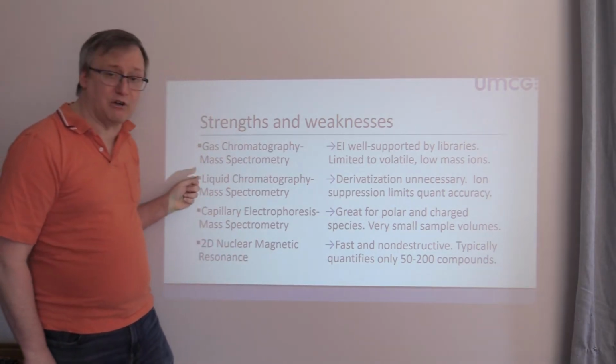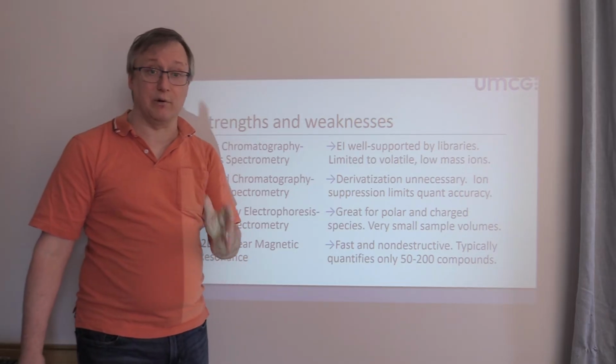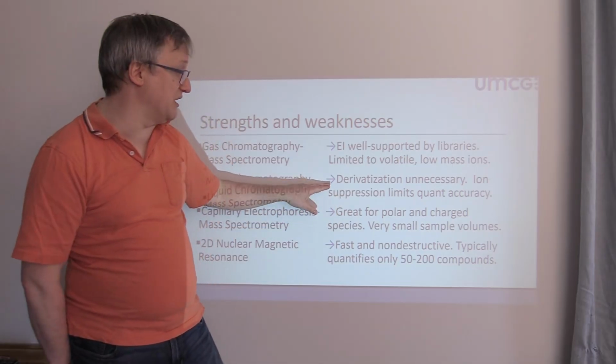Okay, next up, liquid chromatography mass spec. Yes, this is very, very widely used in proteomics, but it has a very good usage pattern in metabolomics as well.